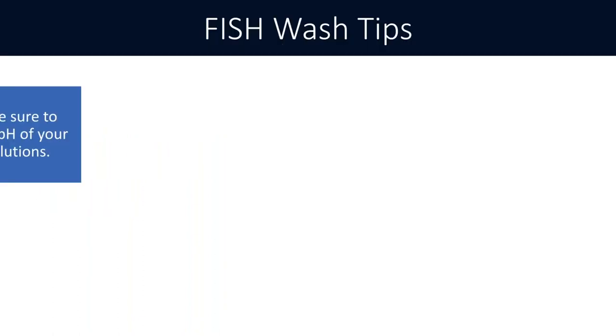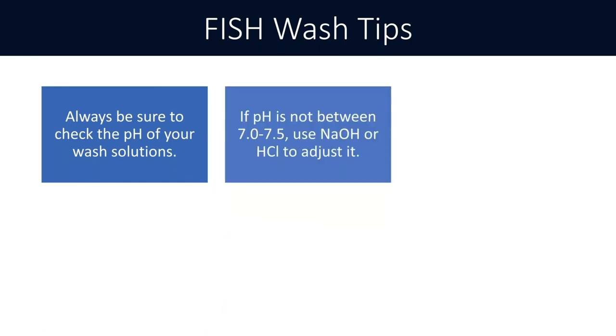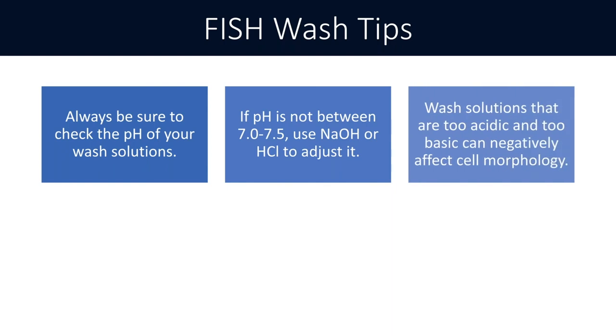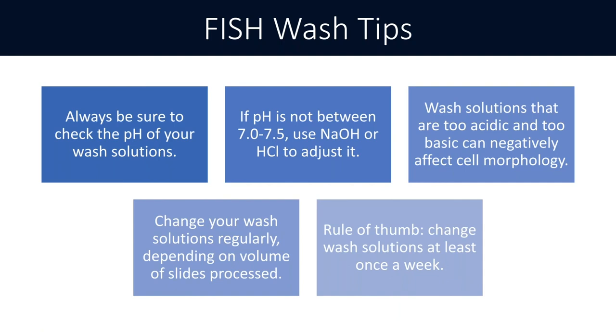Always check the pH of your wash solutions. You want to make sure the wash solution is between pH 7 and 7.5, and use NaOH or HCl to adjust it if necessary, because if a solution is too acidic or too basic it can really affect cell morphology. Also change your wash solutions regularly depending on volume processed. My rule of thumb: change at least once a week; if you're a very high-volume lab running a lot of slides daily, change it once a day. Dirty solution with debris and unbound probe will hinder your signals.